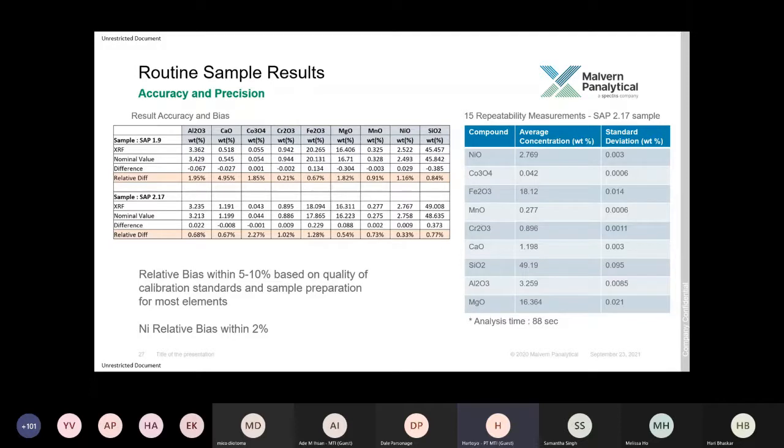Kemudian Bapak Ibu sekalian, di sini kita lihat dari standar deviasinya, baik nikel maupun elemen yang lain mendapatkan hasil yang bisa dikatakan lumayan bagus dan acceptable. Dari sisi presisinya pun hasilnya juga sangat bagus. Jadi saya kira meskipun dengan 1 kilowatt bisa memenuhi kebutuhan, dalam hal ini untuk sampel nikel.